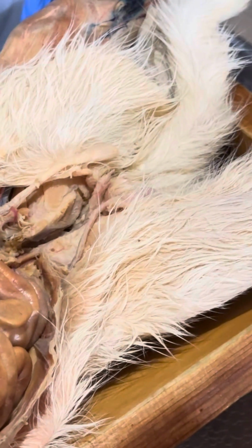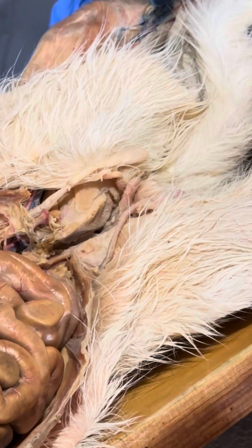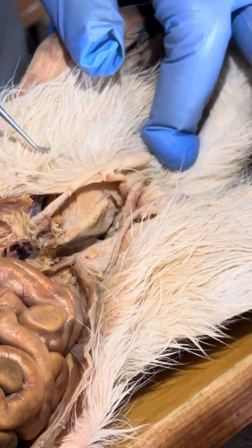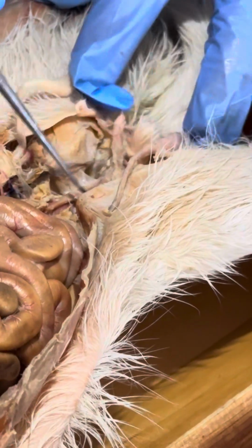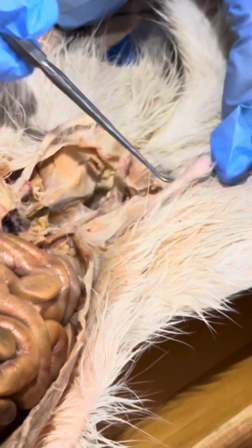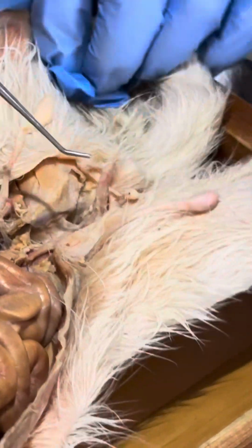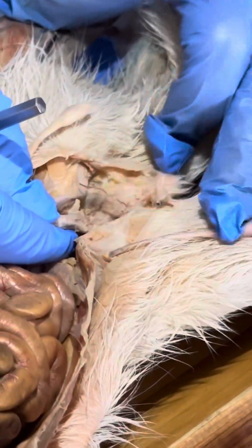That's the opening through which the penis comes in the male, and the vestibule or vagina and urethra in the female, depending on the arrangement there. So what I did was I split the pelvis as close to the pubic symphysis as possible, and then I got the penis out. Came out pretty well.